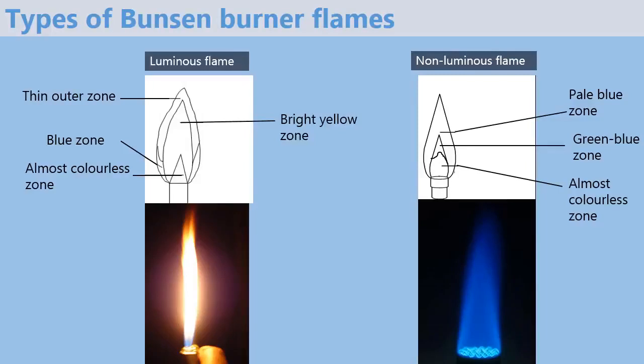Well, that's it about the luminous and non-luminous flame. Can you try to name the parts of the luminous and non-luminous flame on these pictures? Take some time.